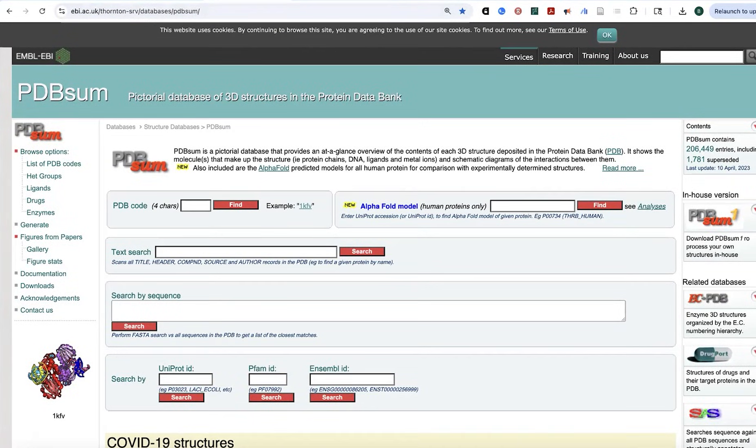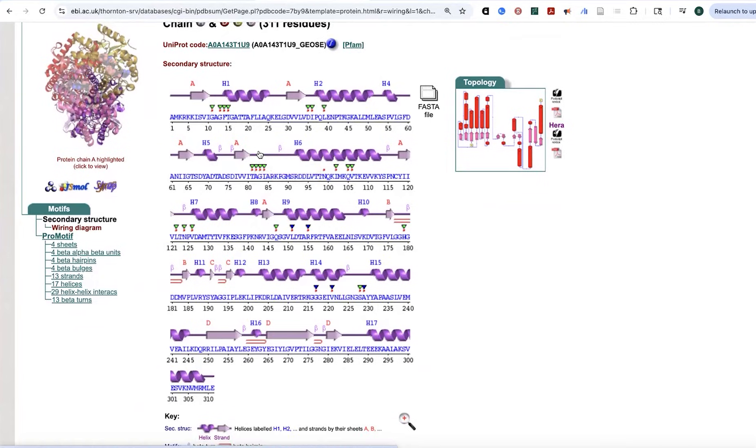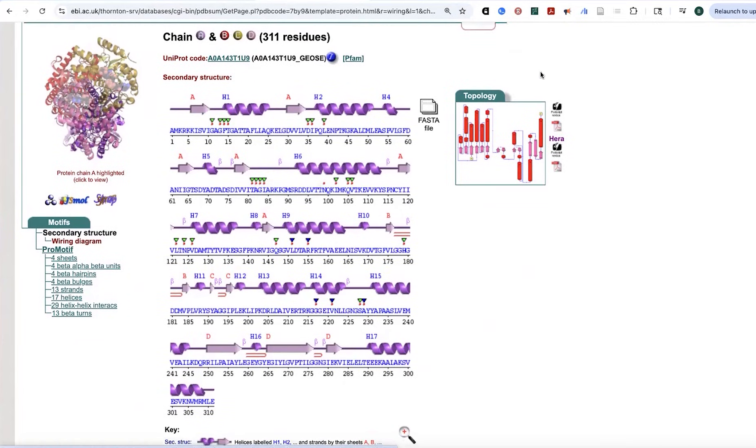So both of these tools are really useful if you want to do one of those kind of secondary structure overlaid over the sequence.